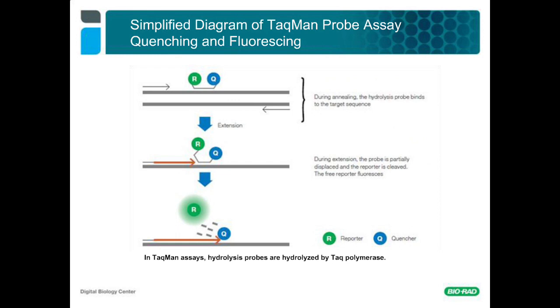For designing assays, it is useful to know the range of temperatures that the enzyme can tolerate and polymerize efficiently at. The optimal temperature for the polymerization or anneal extend step is 55 to 65 degrees. However, if necessary, it may be possible in ddPCR to go as low as 50 degrees and as high as 75 degrees in some assays.